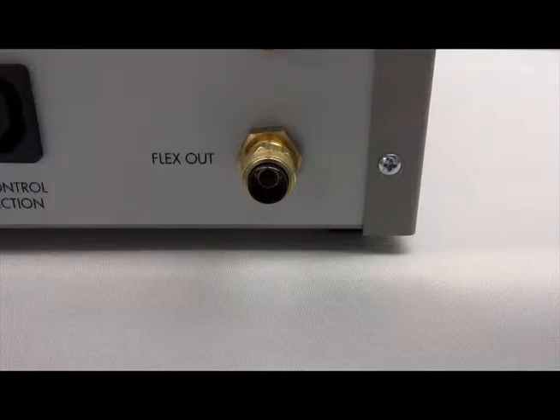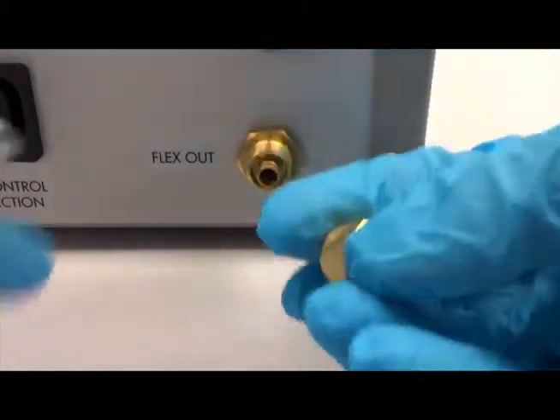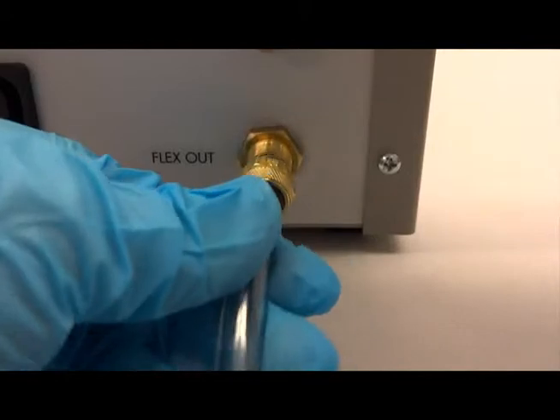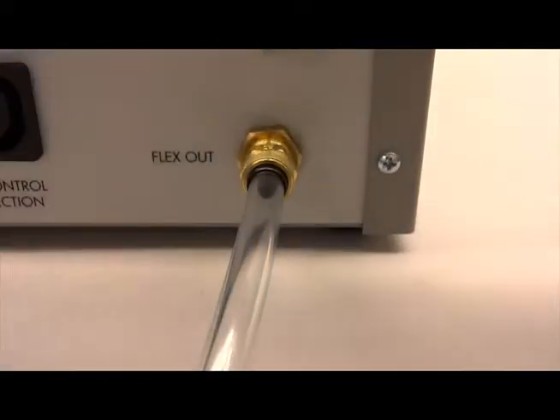To do so, remove the brass nut with the acetyl sleeve from the flex out port, insert the tubing into the acetyl sleeve, push the tubing onto the fitting on the back of the flex link box, and thread the nut onto the fitting by hand.